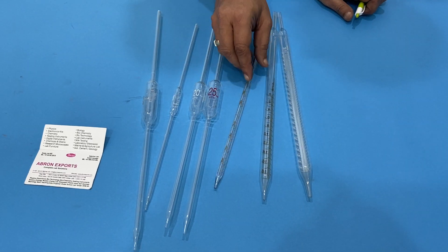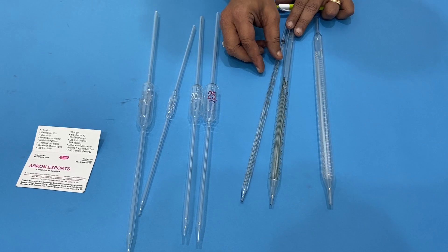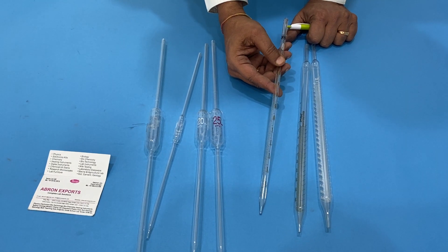If you are using another kind of pipette, these are called serological pipettes, graduated pipettes, or measuring pipettes. They come in all sizes from 1ml to 50ml or 100ml.